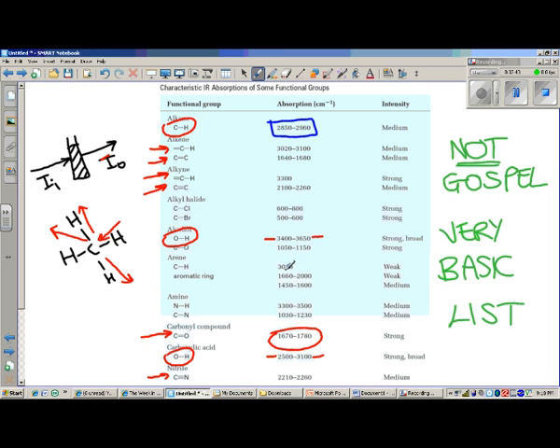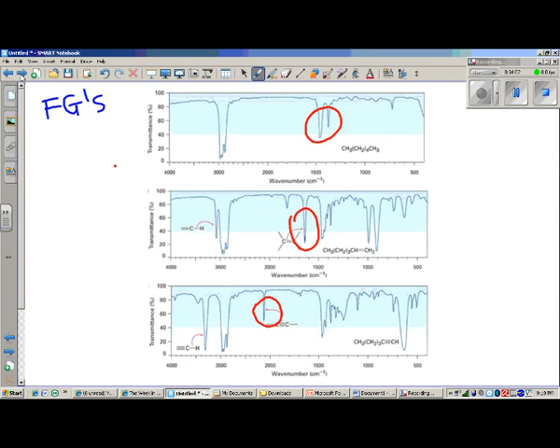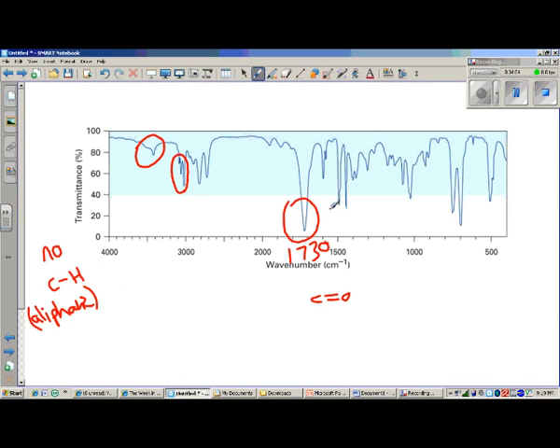And the way that we can tell which we have is we can just take a look at, see if we have any sets of peaks that I mentioned before, a little grouping that corresponds to whether we have an aromatic ring or not. So let's see. And we actually have a little group of the guys right here. So what this probably means is that C stretching is due to an aromatic ring.